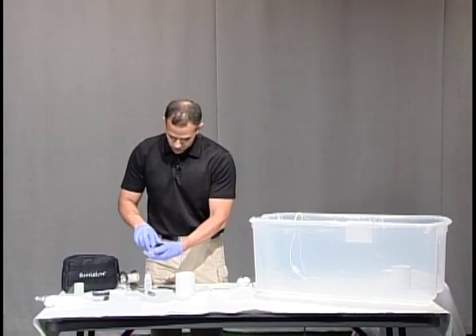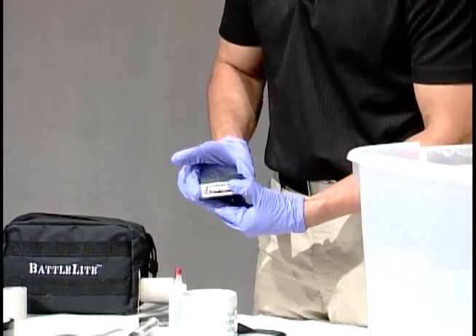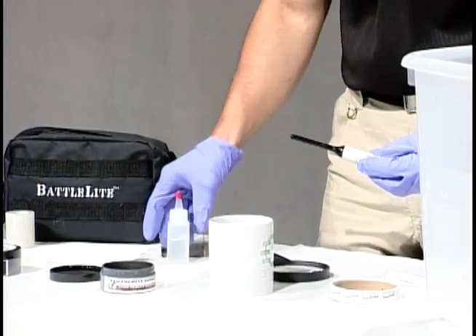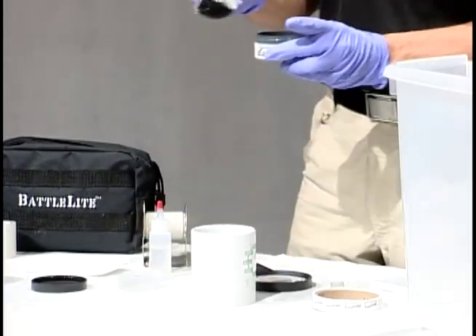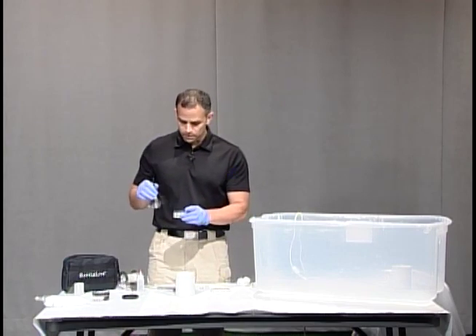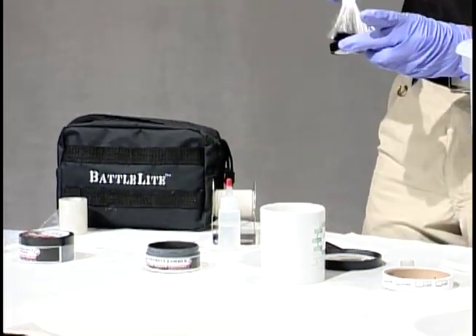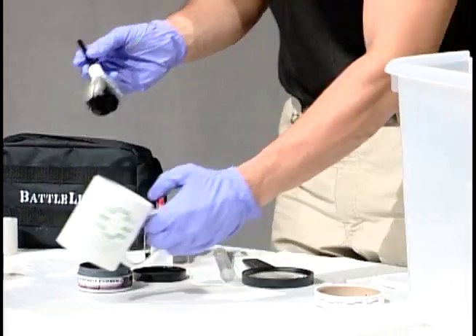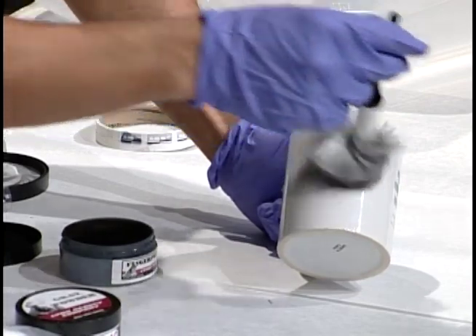Since we're using the white mug we're going to use a nice black powder. It's important that you use a high quality powder — I'm using the super black powder from Lynn Peavy. I'm going to fan my brush out. It's important when you have your powder that you don't jam the brush into the powder; it's going to ruin your brush and contaminate your powder. So what you do is take just a tiny bit, put it on the side here, and that's going to be enough to dust for fingerprints.